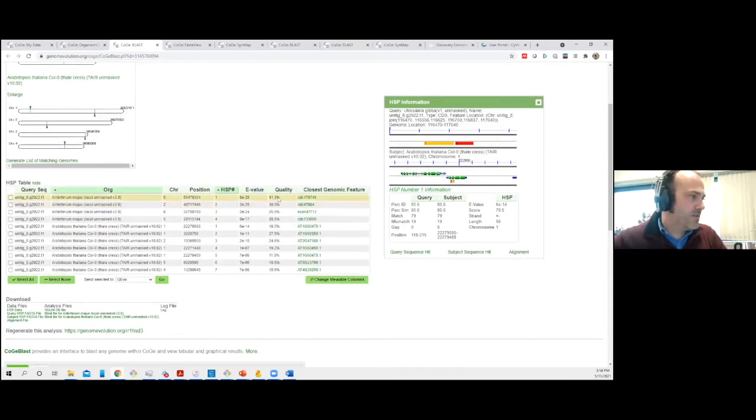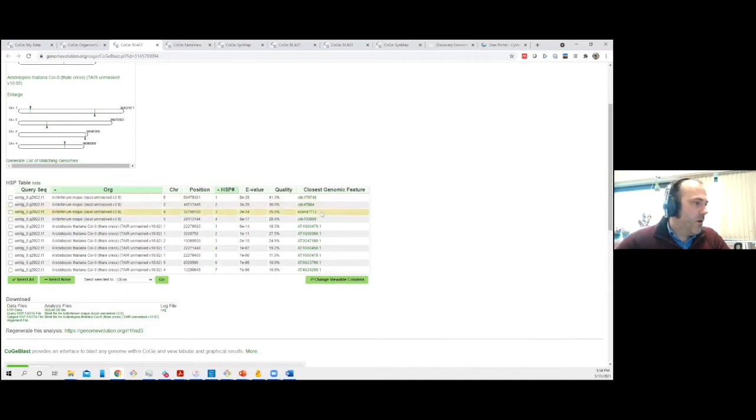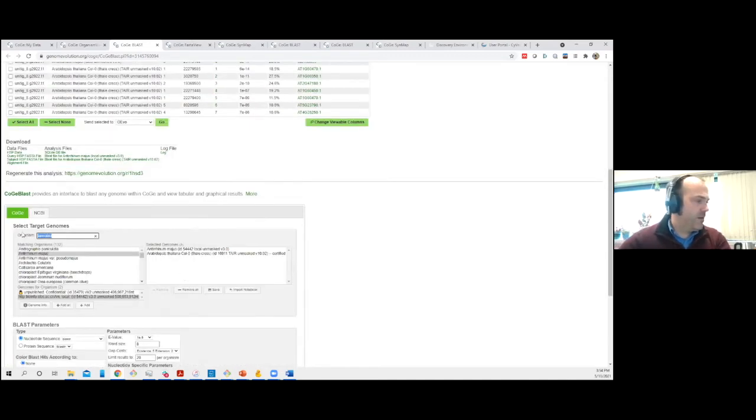Okay, we can also look at this hit in Snapdragon, the top hit. We see, okay, this is just a single exon hit. Yeah, same here. So probably what we're identifying from Utricularia is just a conserved domain in that gene from Utricularia with these other 2 species. So it may not be a glycosyl transferase or whatever, but it's probably something to do with, I'm guessing, metabolism.